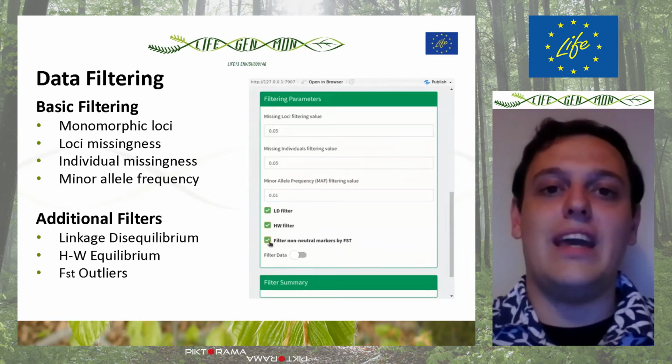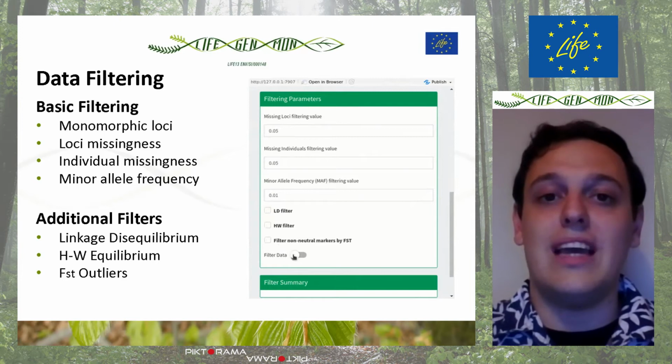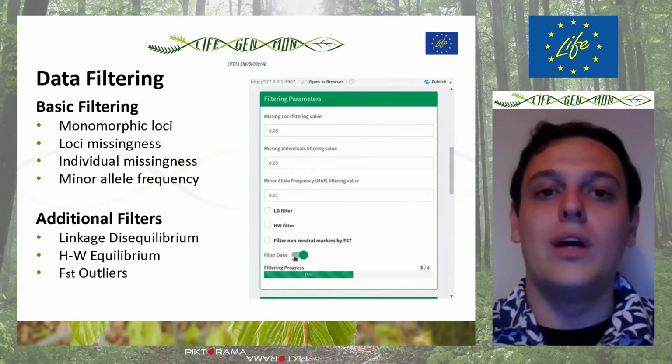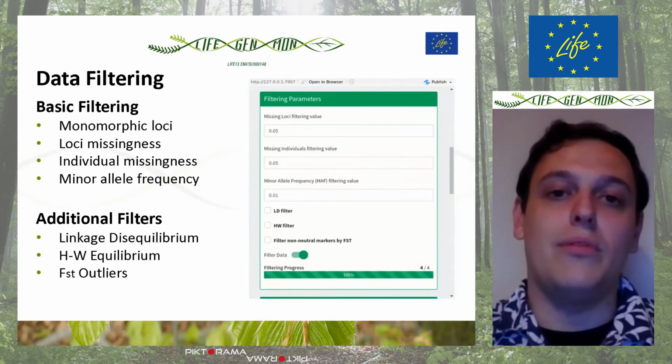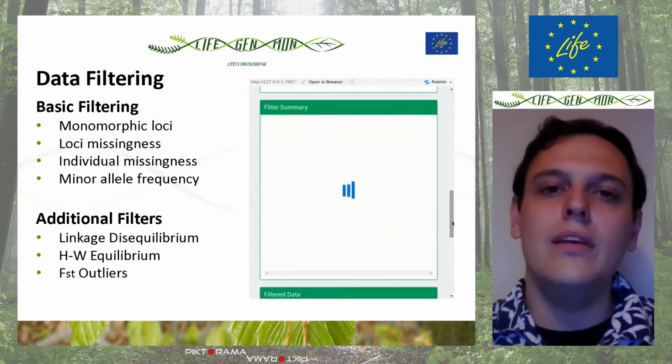This is a bit of a rough and ready version of ensuring that potential sequencing errors are filtered from the data. And we implement this through filtering any loci which are found to be out of Hardy-Weinberg equilibrium in over 50% of the assessed populations in your study.